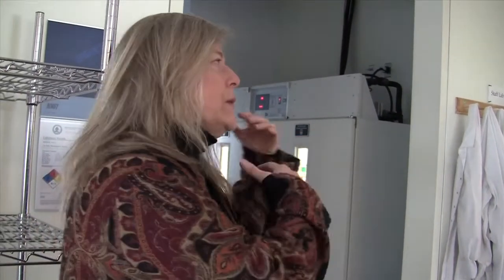It's kind of the Amazon.com of algae is the goal here, where they have a website. You can get on the website, you can order your strain of algae. They will grow as much of it as you need for your research or for your applications and ship it out to you. We have at least several orders going out every day, all over the world. This is researchers in industry and in basic research in universities. And aquaculture people are very interested in all of this, so that's what's going on.